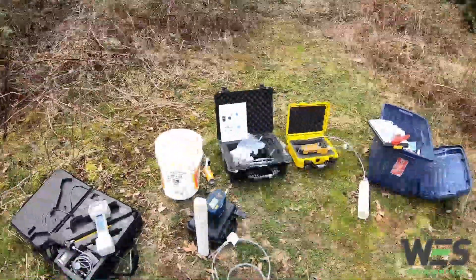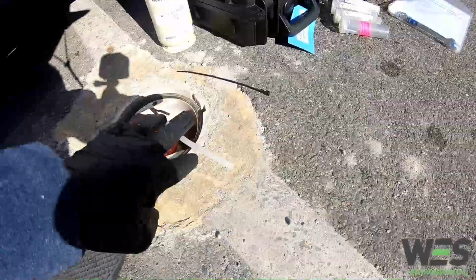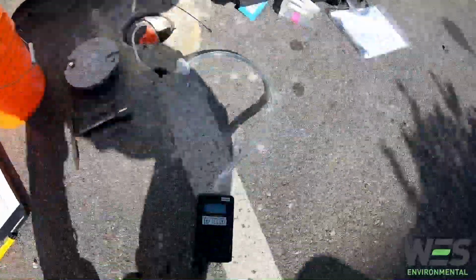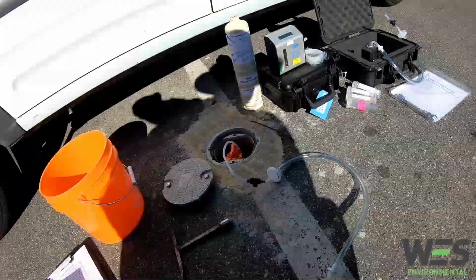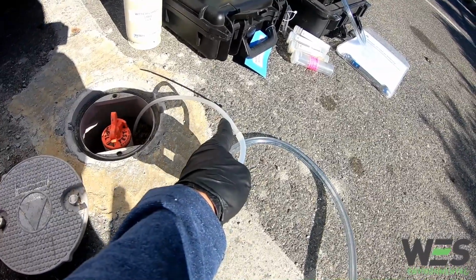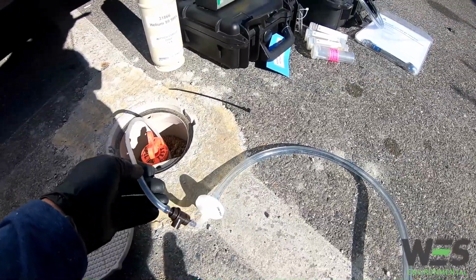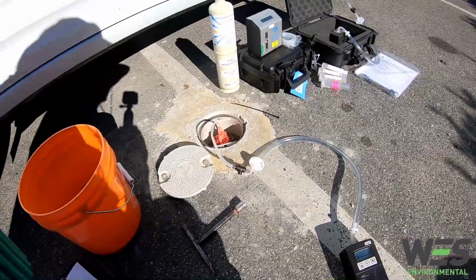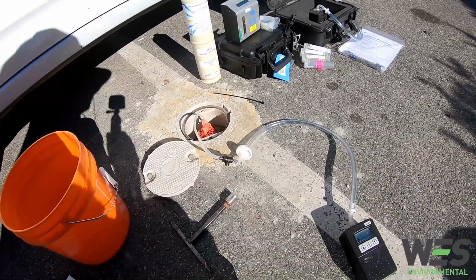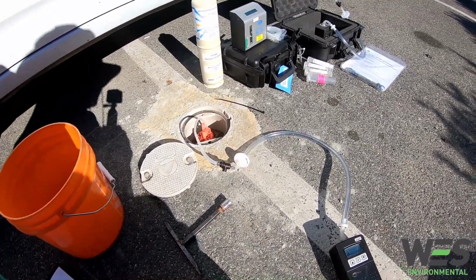So yeah, that's all the tools here, and then I'm gonna go through it step by step on how to collect the sample. I've got the soil vapor probe here. Got the pump, turn it on, start it pumping away. And then I'm gonna watch the line for any water. For the first few minutes here, I'm going to just leave it and let it pump air out and purge, and it's going to pump out whatever vapor's in there for at least 15 minutes. I'll probably leave it longer, and that way we're getting a nice representative soil vapor sample.